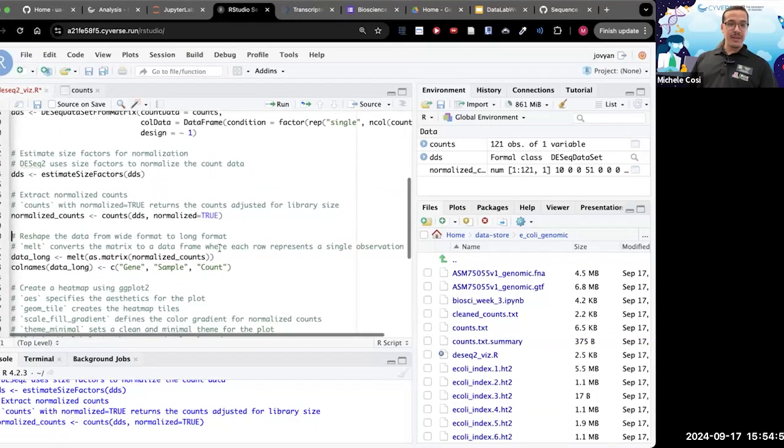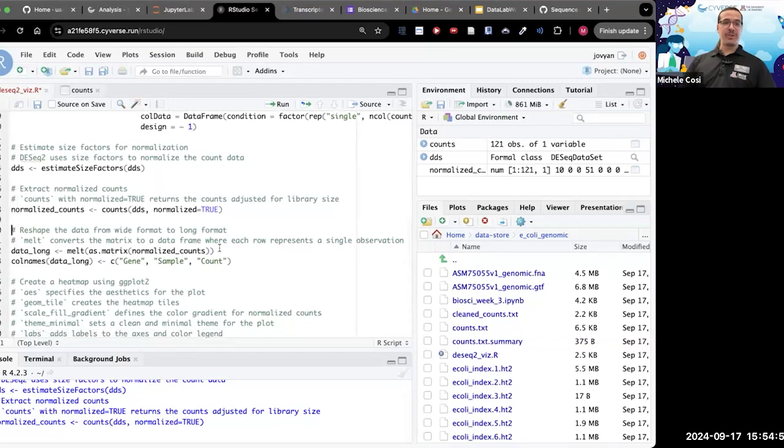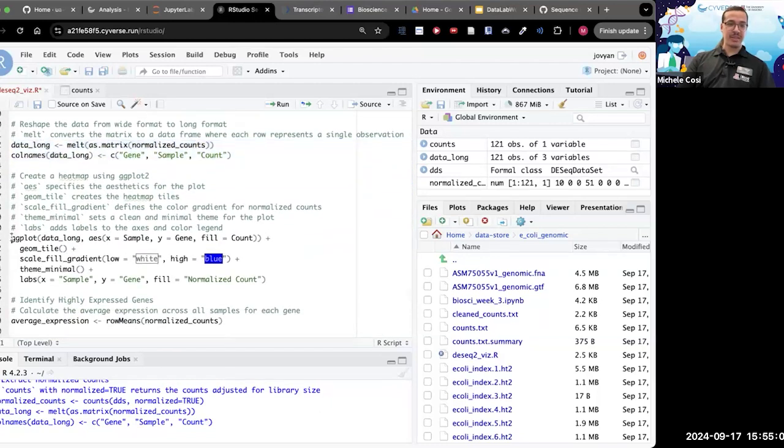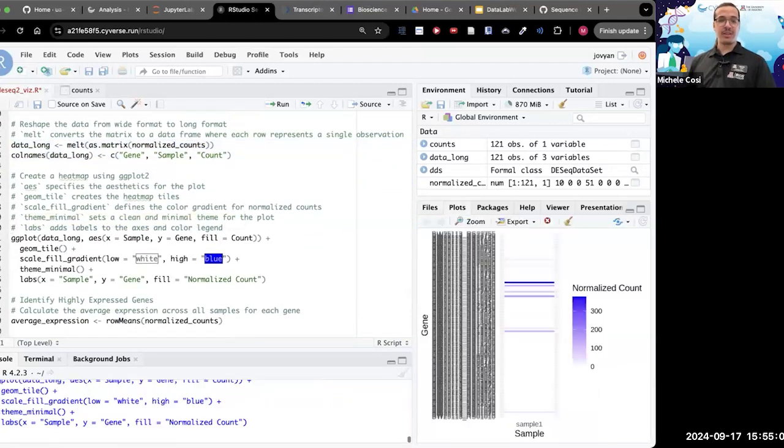So we can actually go ahead and create the matrix now. Oh, sorry, I'm getting ahead of myself over here. Here we go. ggplot, create the matrix. And this is the crappiest little heat map ever. But hey, something exists. There are some genes inside those very bad alignments. 1.27% or 1.43, whatever it was, gave us a little bit of a result.